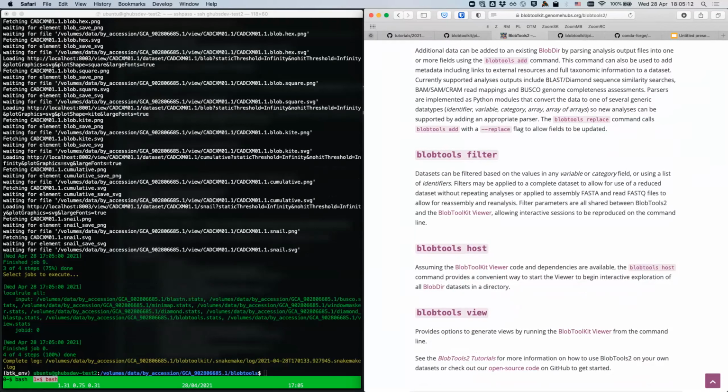I think I've done this also with just some of the output files, based on their coordinates. You can take the contig names and then say the coverage is too high or too low, and you can filter on that. Then I took out all of those using the blastdbcmd command or something, did the filtering, and double-checked further. So the problem is you still have to do a lot of manual work, but that's just the nature of the game, I think.